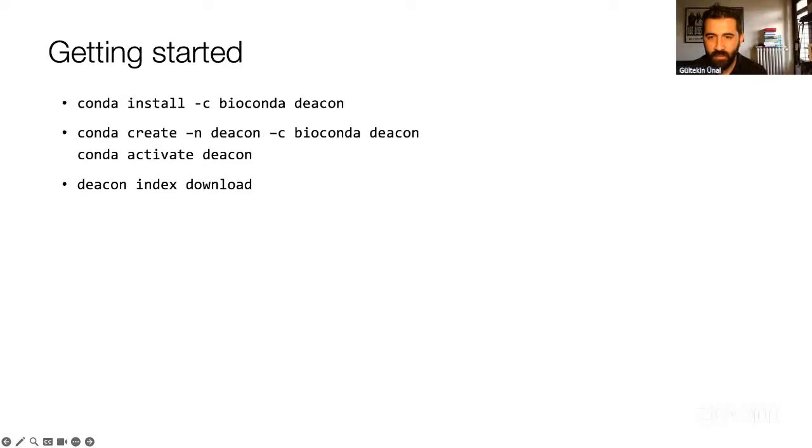Thank you. So the next one is, are there any specific things to be aware of when using Deacon, especially for virus sequencing data? Are you going to demonstrate that? Yeah, so I was going to just do a quick demonstration, but for viral sequencing data, I would say that the panhuman index has been masked against viral minimizers, from the RefSeq catalog.